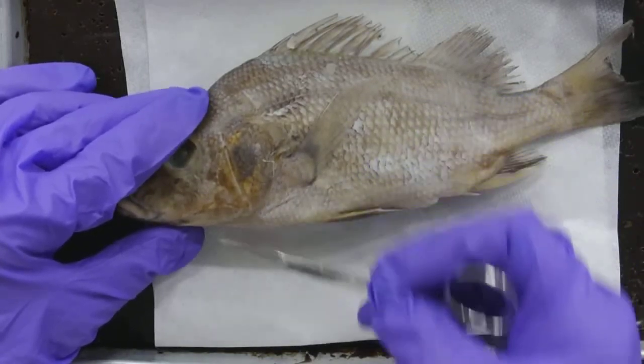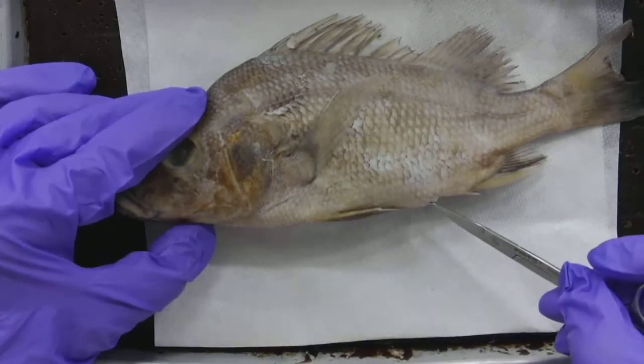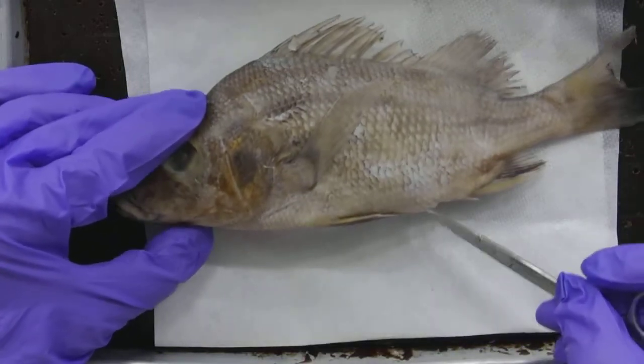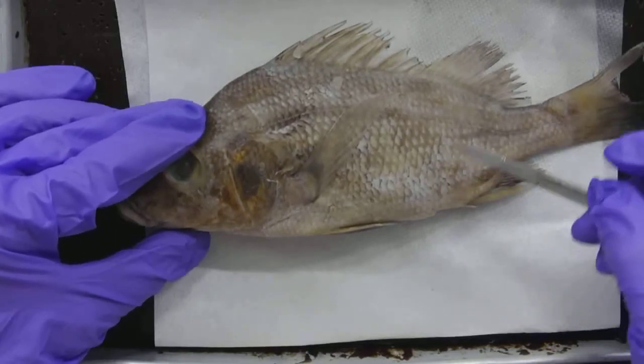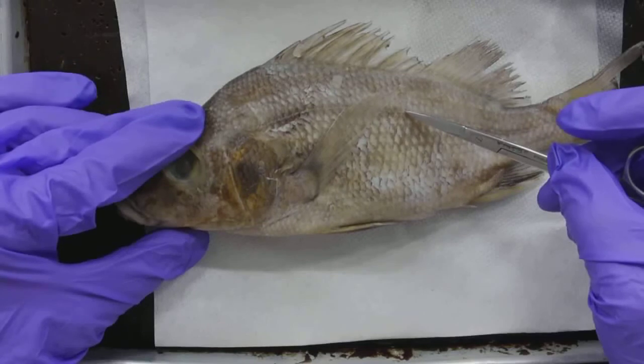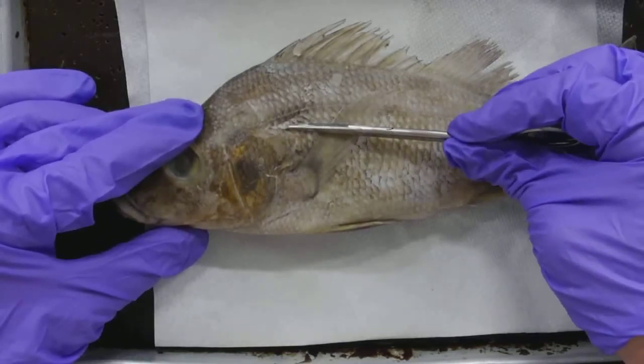The heart is located in here. So I'm going to make an incision from the anus to about where I think the heart's going to be, right underneath the operculum, and then cut up this direction. The lateral line is the absolute furthest I want to go, and it's probably going to be a little bit lower than that.